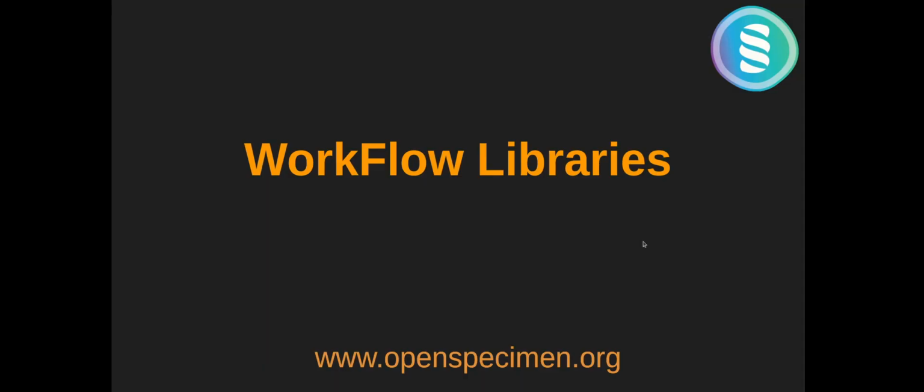Good morning everyone. This is Saurabh from OpenSpecimen, and today I am going to talk about the library features in the workflow. In this video we are going to cover the basics of libraries, what the advantages of using libraries are, and implement those libraries in our workflow.